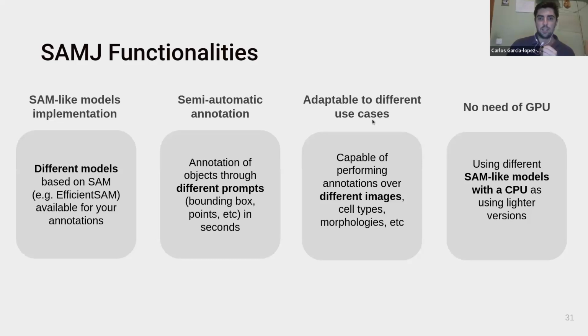We use the original SAM model, so it can be used in any image modality. If you wanted, you could even use it on, I don't know, dog images, but it will work on fluorescence images, on light sheet, or whatever. And you have the different types of prompts that are available in SAM. So you have points, a bounding box, and even a brush.